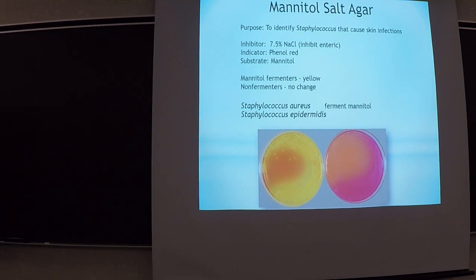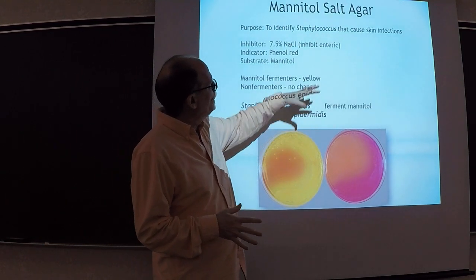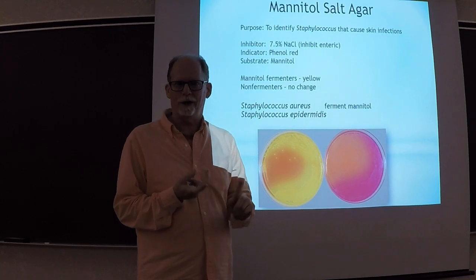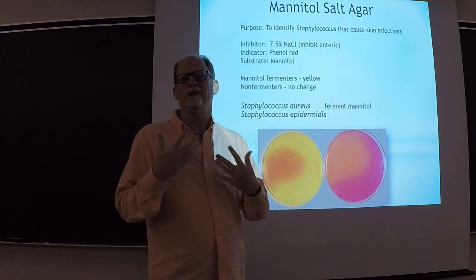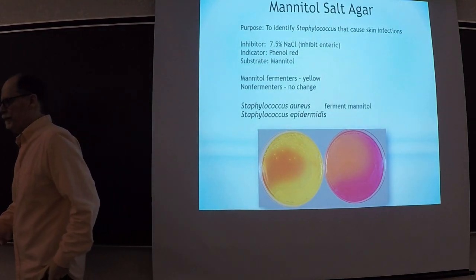All right, now I'm going to explain these concepts, right? Each lab, I'm going to go through this process, what the mannitol salt agar is used for, what the EMB is used for. So in the video you'll be watching for this lab, it'll be somewhat of a repeat of this, but this is just to focus on the P&P instructions.